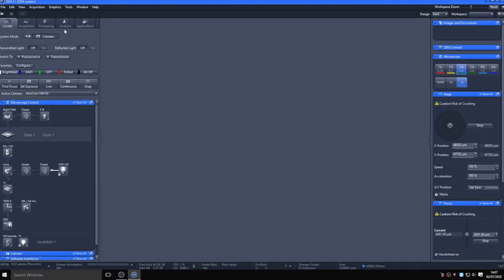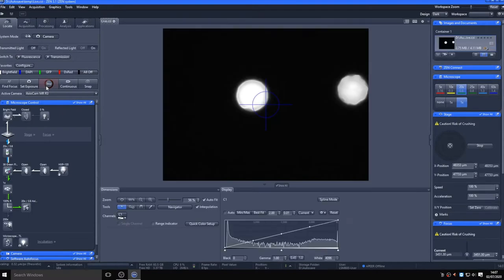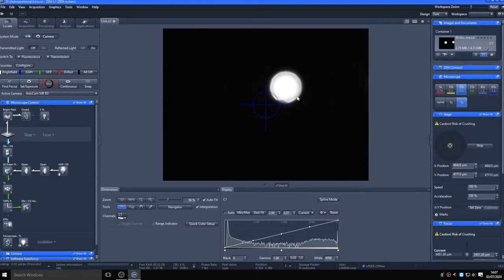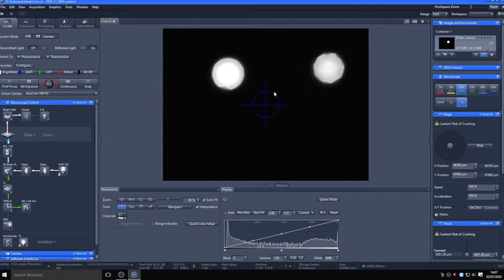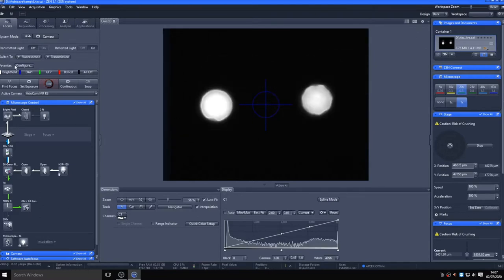Clicking live activates the currently selected excitation and emission path, in this case GFP. Here we can see two autofluorescent pollen grains which we are using as a test sample. You can move the stage around by double-clicking on the live image to center on that point and also check the fine focus.